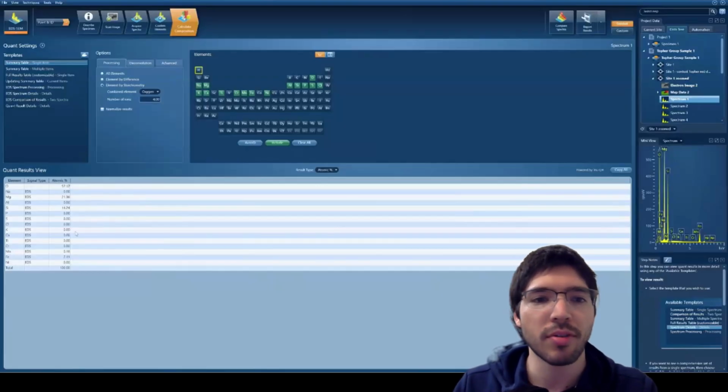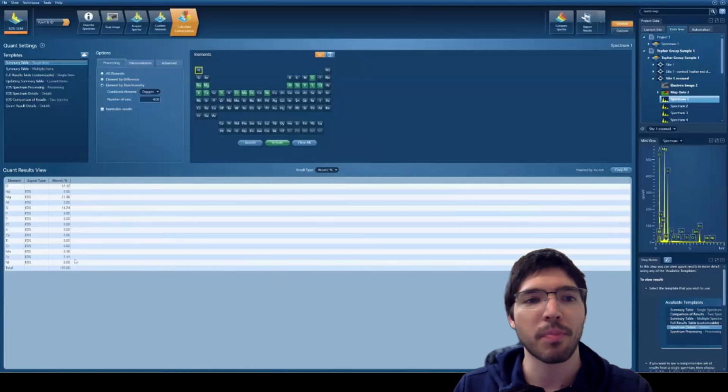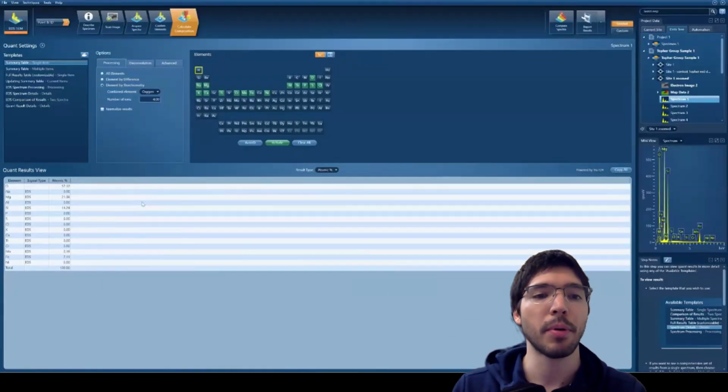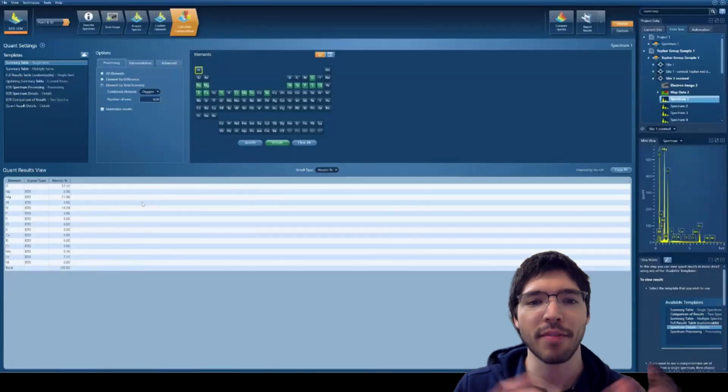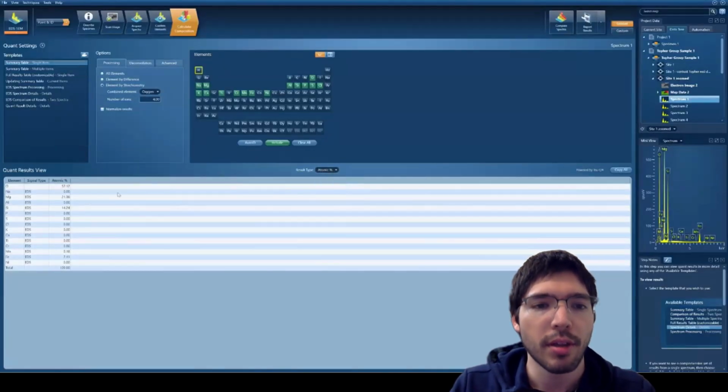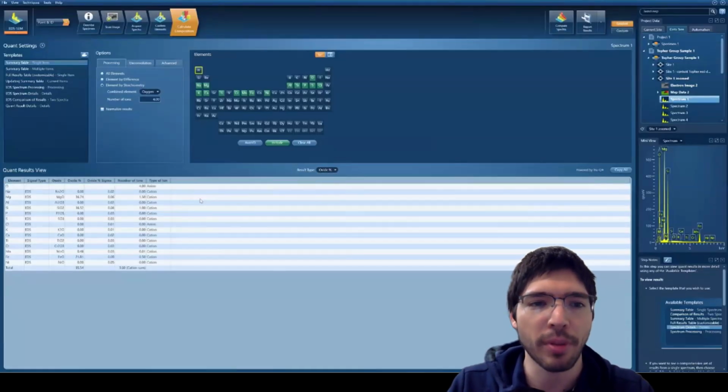So what I like to do instead is I'm essentially just exporting out all the images, and I'm exporting all of that chemical data from all of the sites that we visited and all of the data points, and I'm putting it on an Excel spreadsheet. So that's kind of just simplifying everything. But there are a few things that I do in this part to ensure that we have good data. So the first thing I always do is, well, it's kind of the simple part. I just export the images.